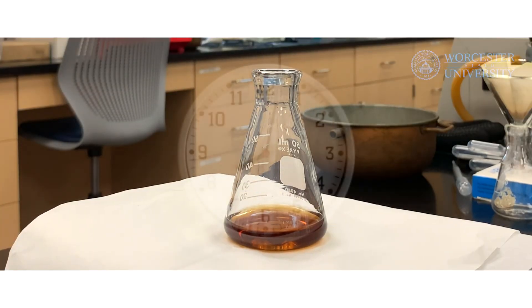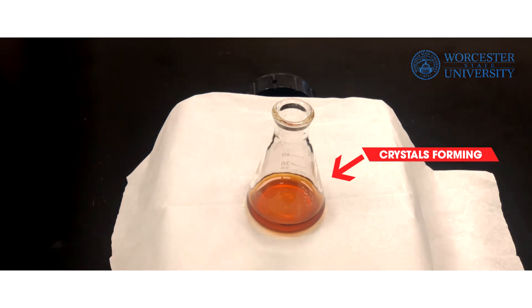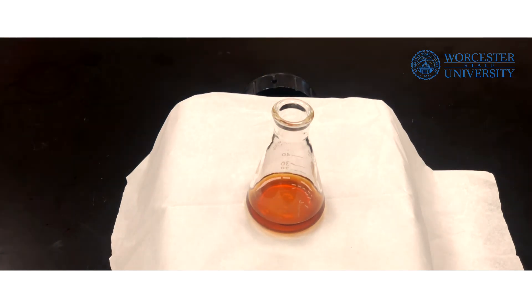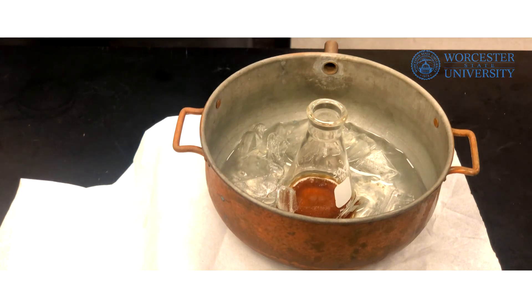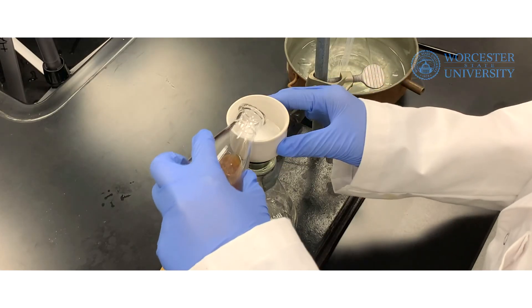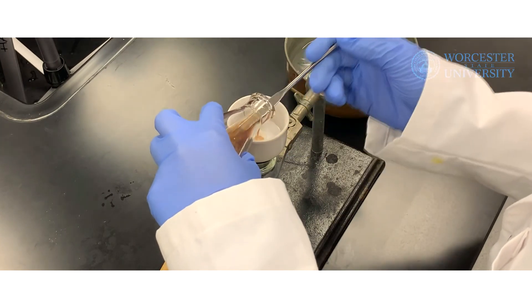Once hot filtration is complete, remove the flask from the heating mantle to begin the recrystallization process. To recrystallize properly, you will need to slowly cool down your solution to room temperature — this should take about 15 minutes or so. You should be able to see the crystals slowly form. Once at room temperature, transfer your flask into an ice bath to continue the recrystallization process. Once the precipitate has formed, isolate the product via vacuum filtration and keep the vacuum on to facilitate drying.